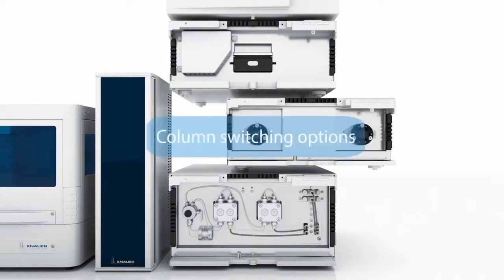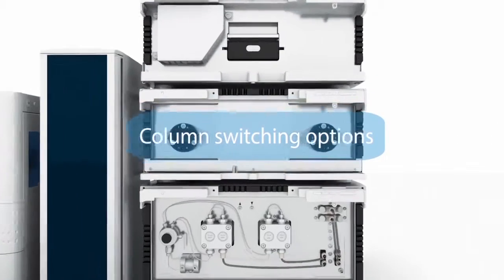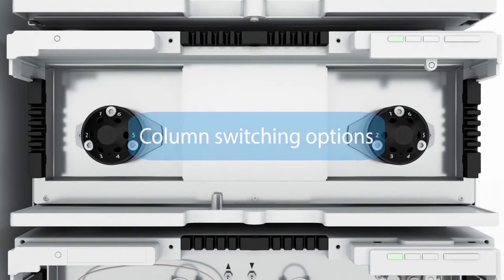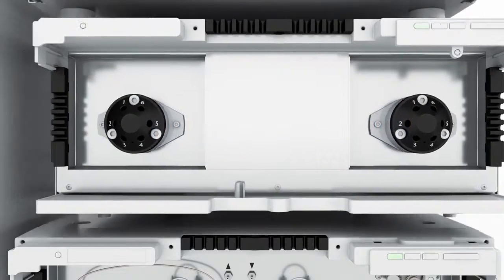Column switching assistants like the shown ASM 2.1L modules make method scouting easy. Up to 6 columns can be switched.